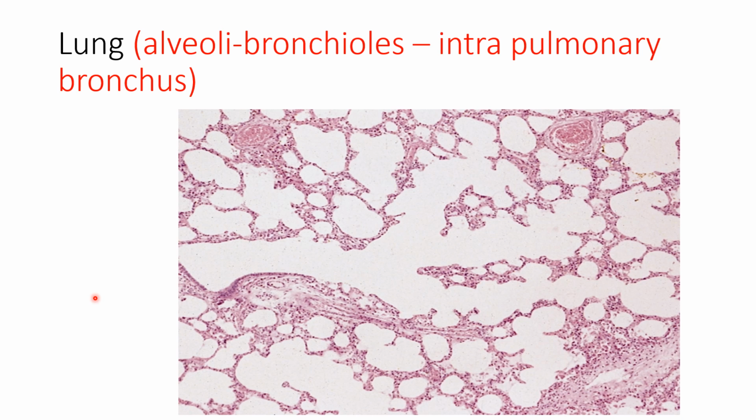When you start your answer in your sheet, you're going to see which microscope you're standing in front of, and you're going to start from it. For example, if you're standing at microscope number 3, you'll start with 3. If you're standing at 18, you're going to start with 18, and so on. When we say move, you're going to move in the direction of the arrow.